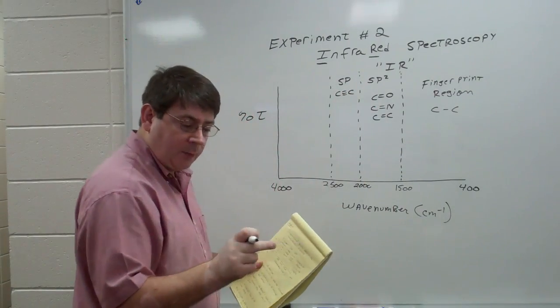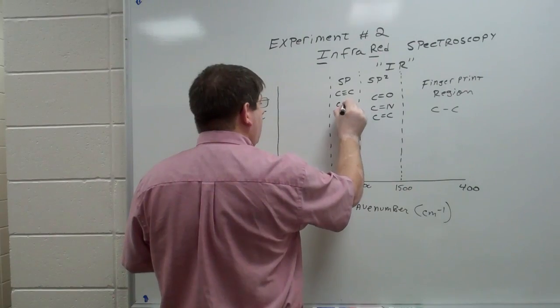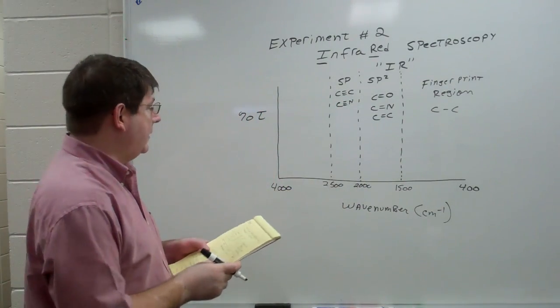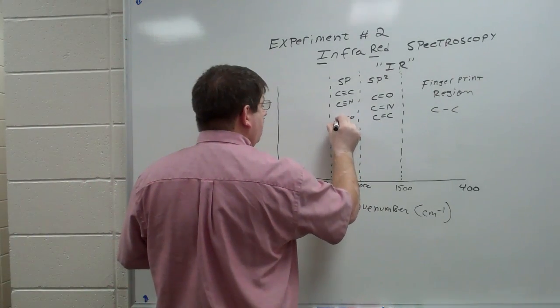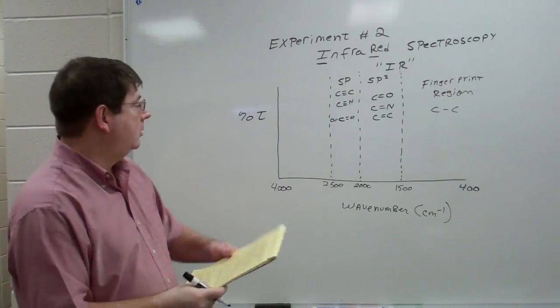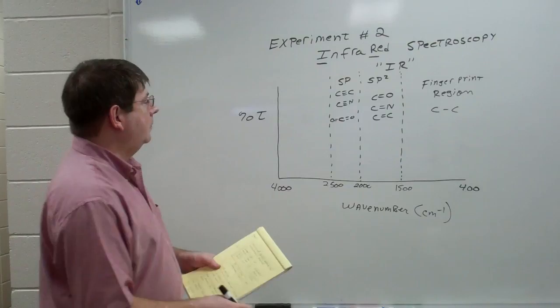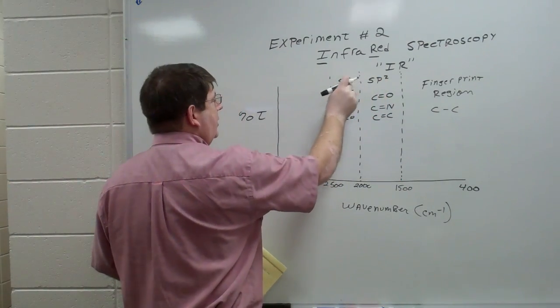We'll find that carbon-carbon triple bond stretch there. We'll also find carbon-nitrogen triple bonds there. So for the nitrile functional group, you'll always find that in that region. And you can find the carbon-oxygen double bond of carbon dioxide there because carbon is sp hybridized. Okay? So this is the sp2 region. This is the sp region.